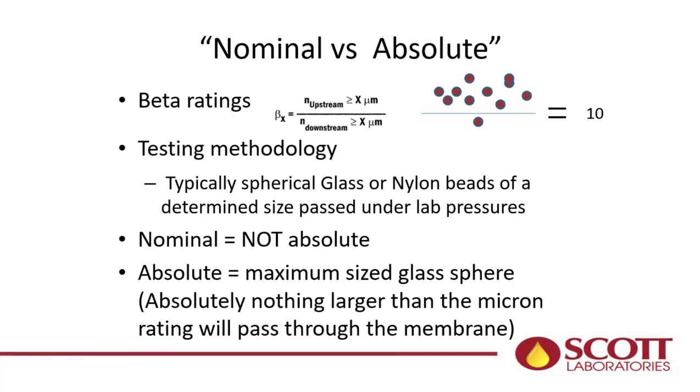I'm not going to get into this too much, but I think there are two concepts to really be cognizant of when you're talking about shelf stability, sterility, and eliminating populations of yeast and bacteria that could cause you problems downstream in the bottle. Nominal and absolute. They're two different terminologies and they're not interchangeable. Nominal means that most of the pores and the pathways are a particular size, and they will retain a particular size organism or solids. Absolute means that every single one of those pores is exactly the same size, and you can test that.